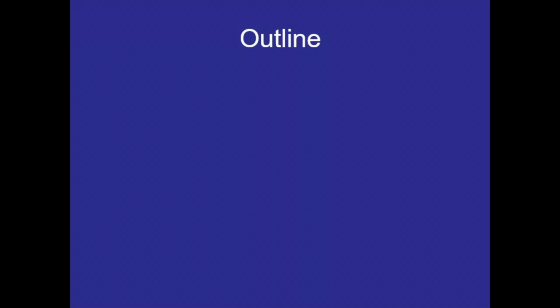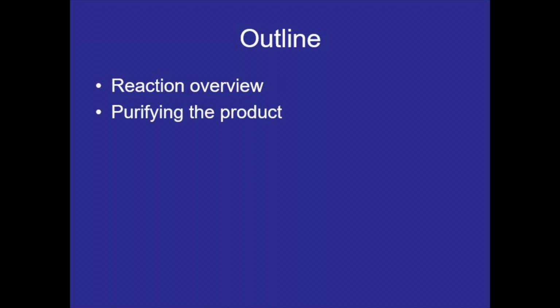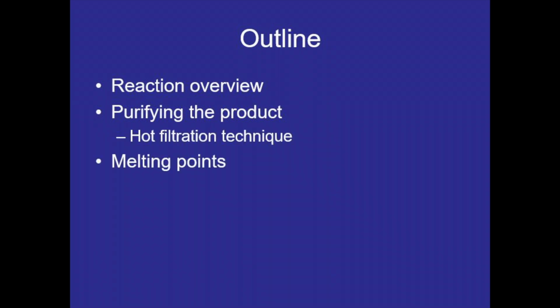Here's the outline for what I'll be going over in this video. I'm going to talk about the reaction and some of the conditions which are pretty specific for this reaction. Then I'll talk about purifying the product and go over the hot filtration technique. Then some concepts about melting points, and in the end I'll show you the actual experiment.